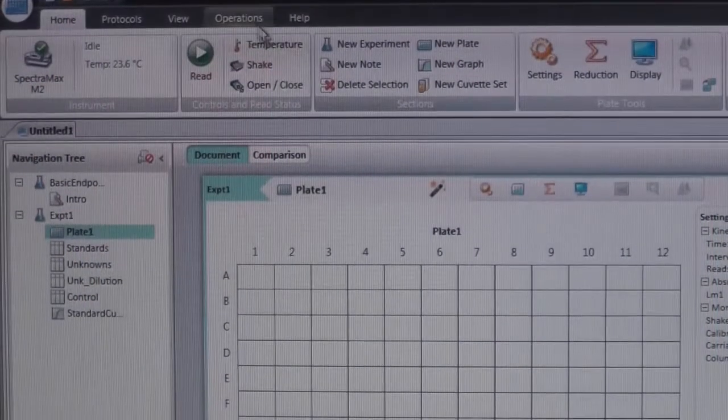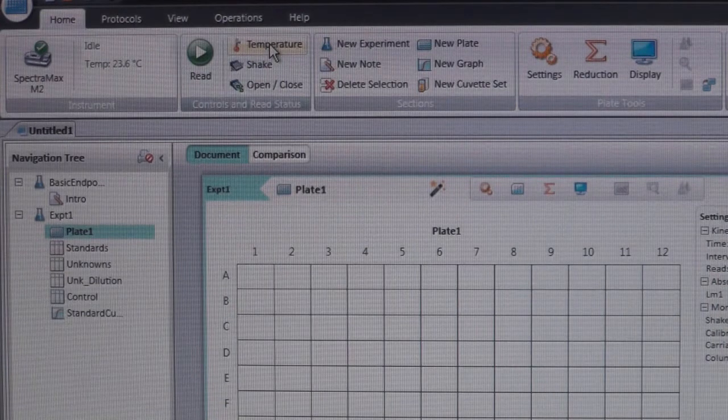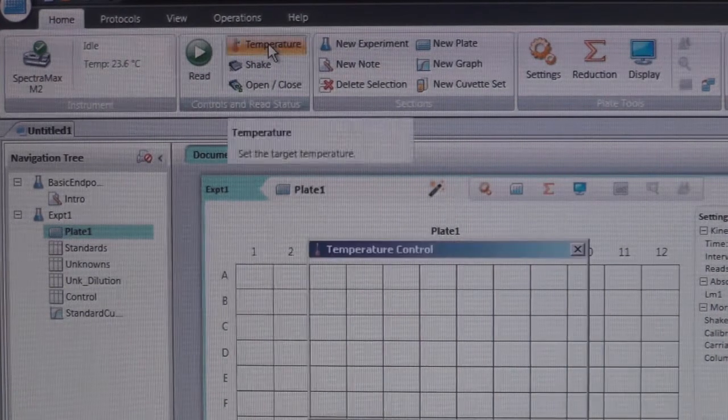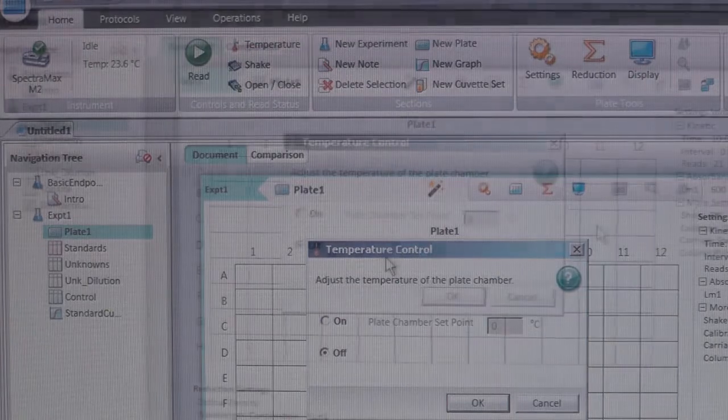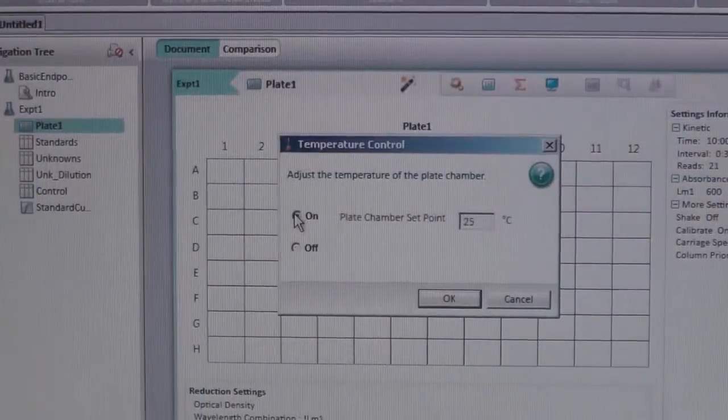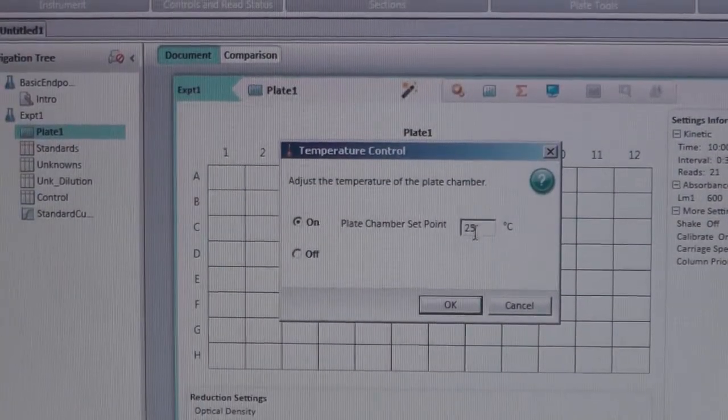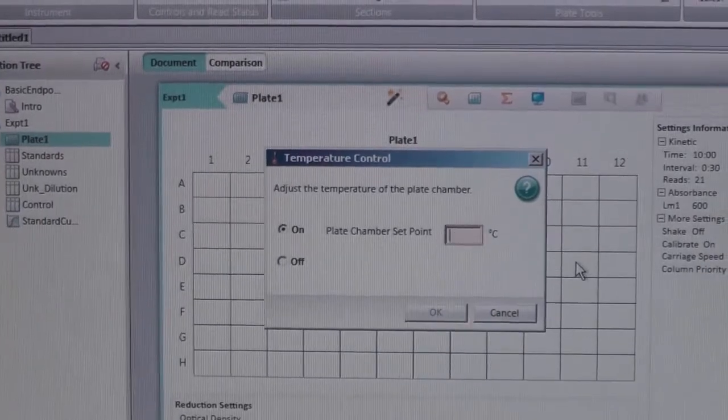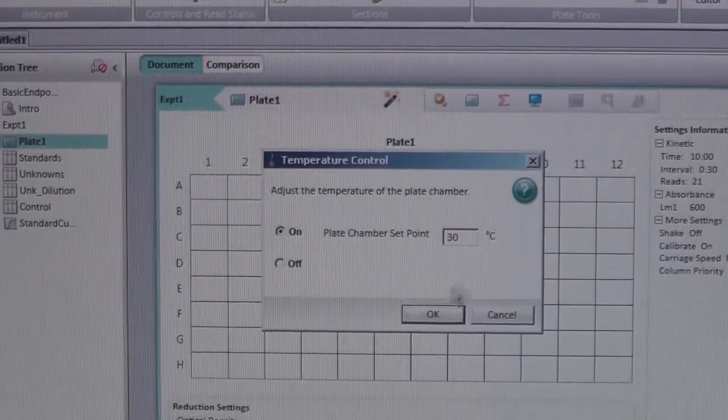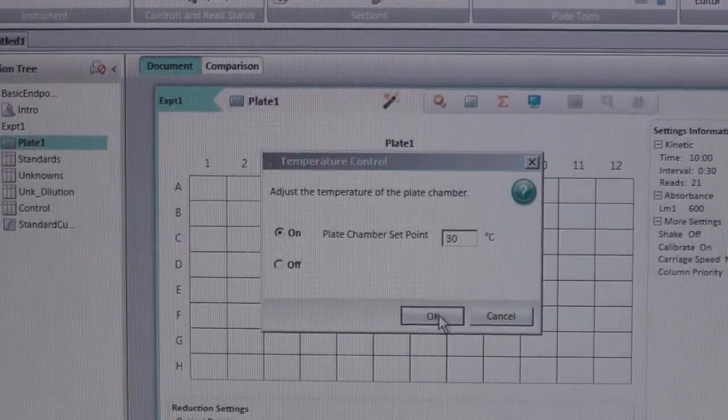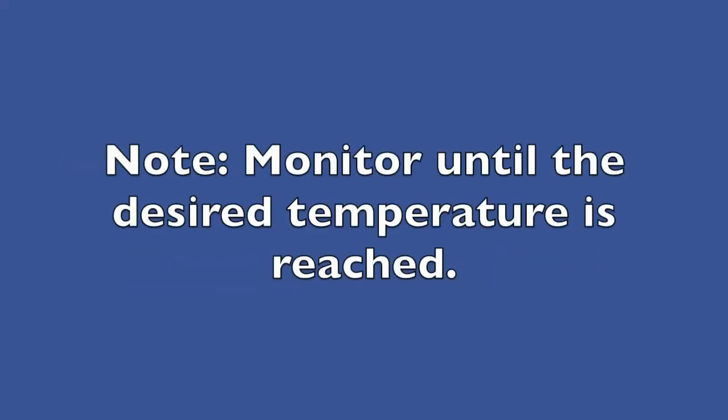The temperature of the plate reader is also adjustable. To set the temperature, click on the temperature icon located in the top panel. Select On, then proceed to set your desired temperature. Click OK when finished. Please note, the temperature can only be set at ambient temperature or above. It cannot cool below room temperature. Make sure to monitor the temperature and to not start your experiment until the desired temperature has been reached.